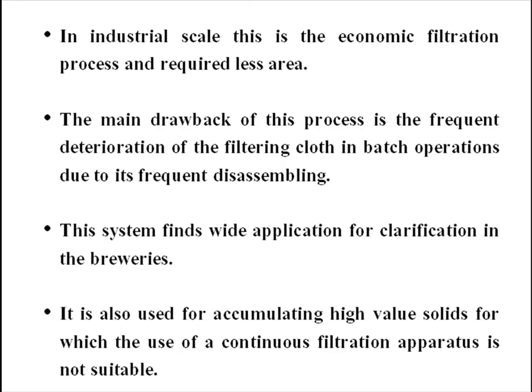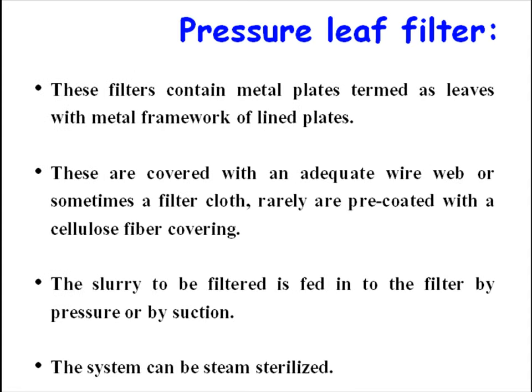In industrial scale, this is the economic filtration process and requires less area. The main drawback of this process is the frequent deterioration of the filtering cloth in batch operations due to its frequent disassembling. This system finds wide application for clarification in the breweries. It is also used for accumulating high-value solids for which the use of a continuous filtration apparatus is not suitable.